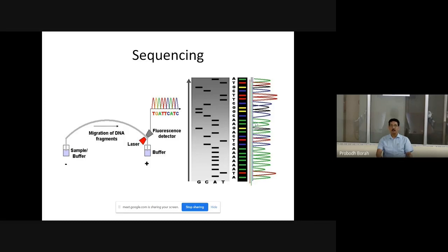While doing PCR amplification, you use two primers: one forward primer and one reverse primer. When sending purified amplicons for sequencing, you can send either both primers or one single primer. If you send the forward primer, you get one sequence. If you send both primers, you get two sequences - one representing the sense strand and the other representing the anti-sense strand.